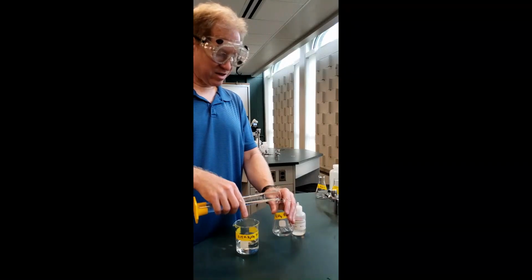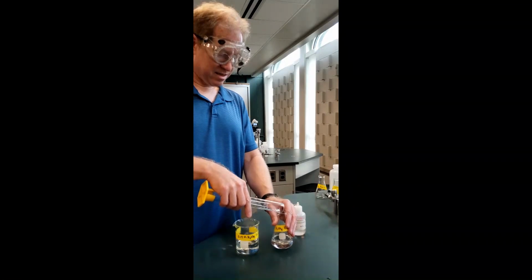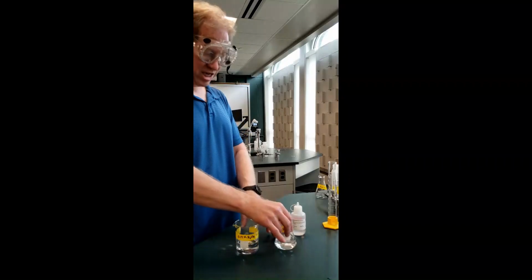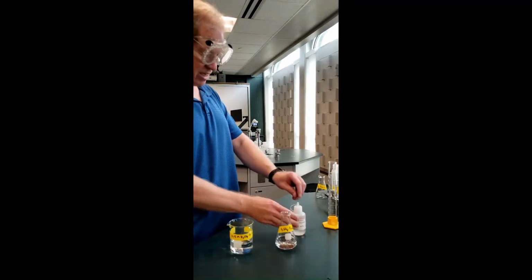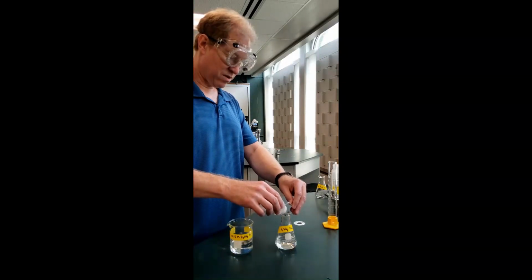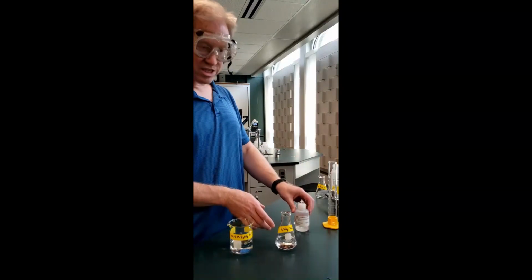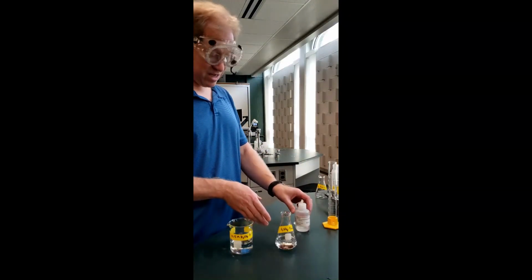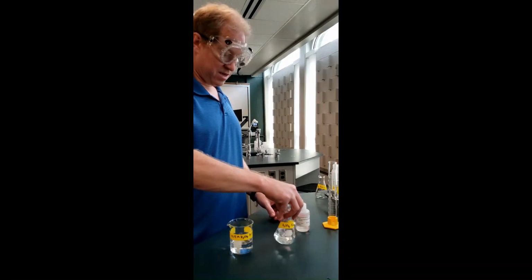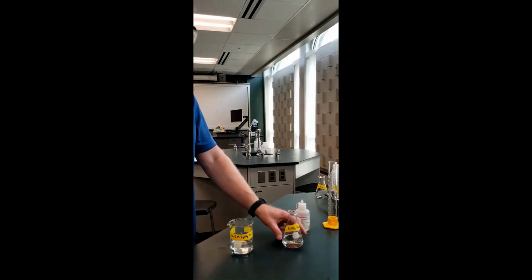This is mainly so that you can have an easier time seeing the color change. You don't actually need it as far as the reaction, but when you see the whole thing change color, it's a lot easier than just a little layer of it. And then it says put in 5 drops of the indicator, and if you put in 6 drops or 3 drops, doesn't really matter. Mix it up there like so, and this is our first sample.